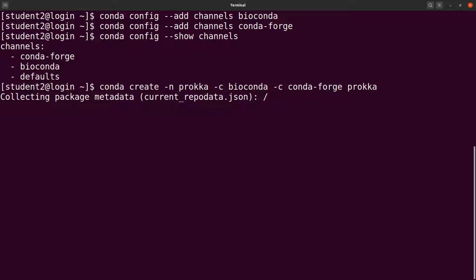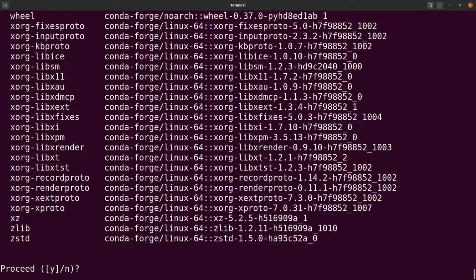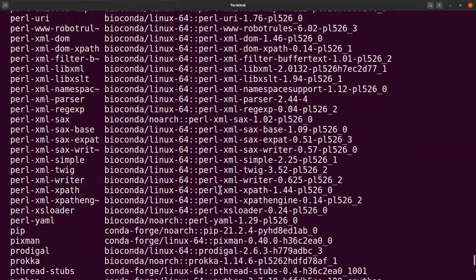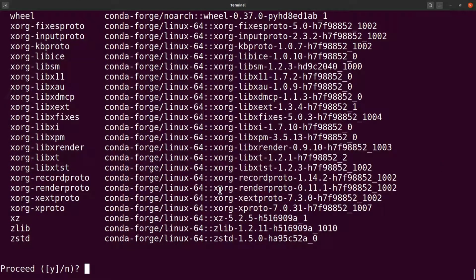And then you wait for the installation to proceed. You'll be asked to confirm. So you wait and then you confirm and install. Please note that sometimes, from the start of the entry of the commands for the installation, it will take some time before you get to this page where you confirm. I think mine took about 10 minutes or so. So just be patient and wait for it to resolve.